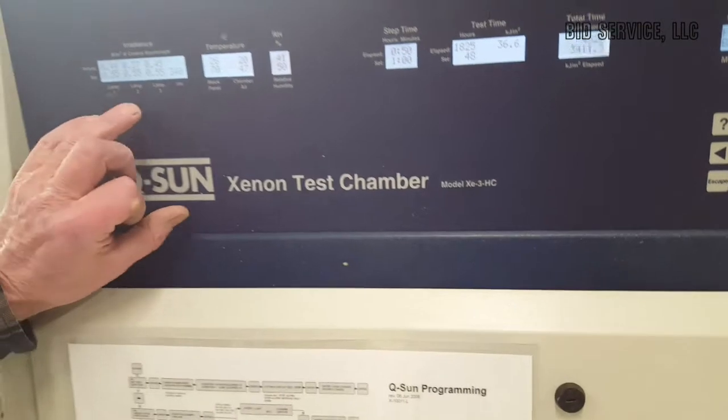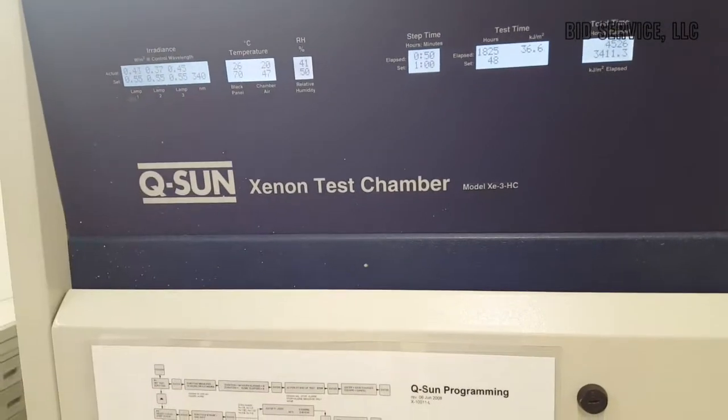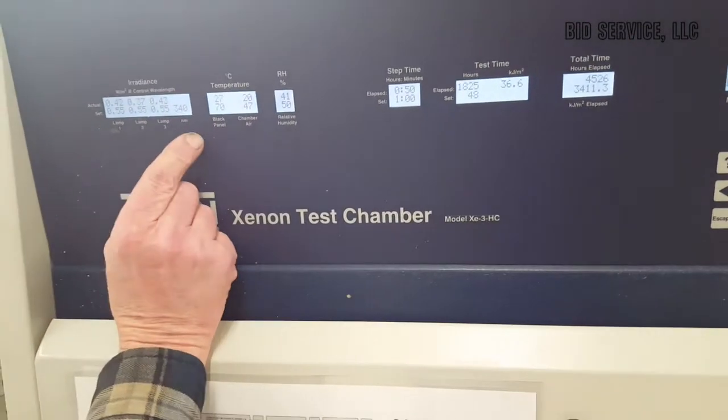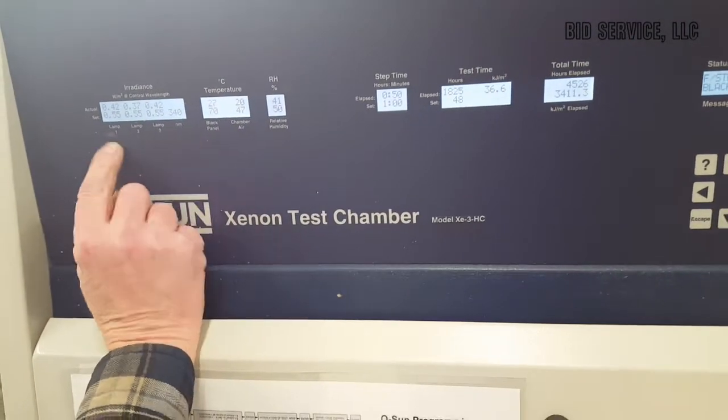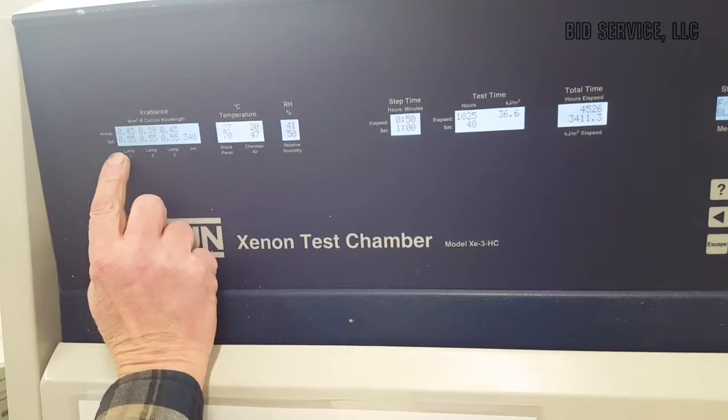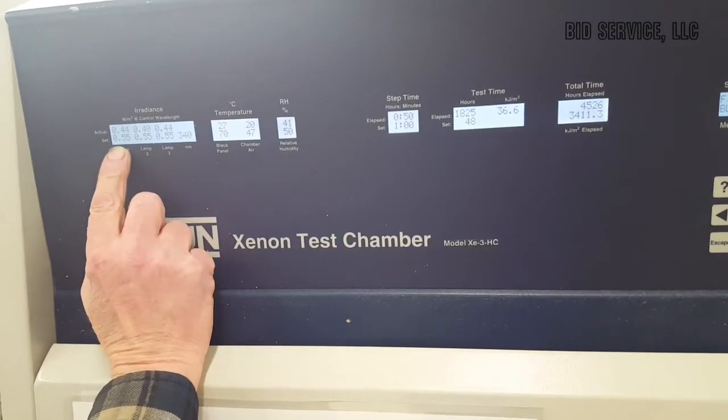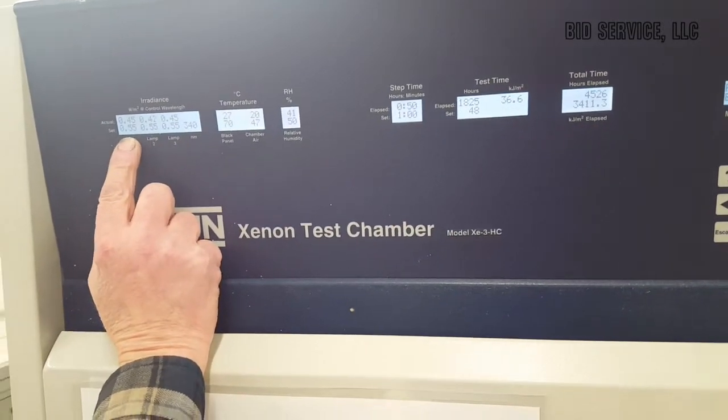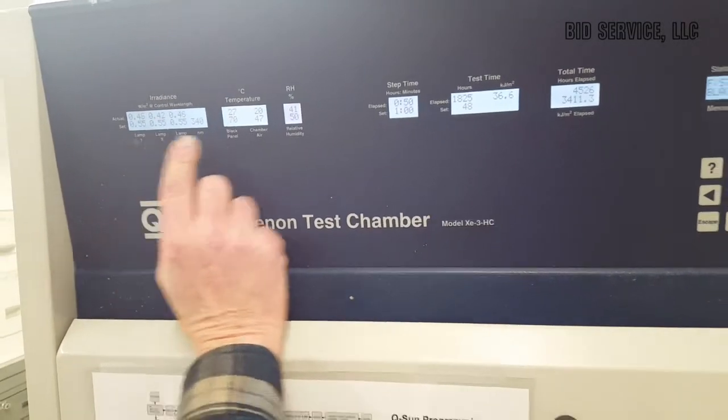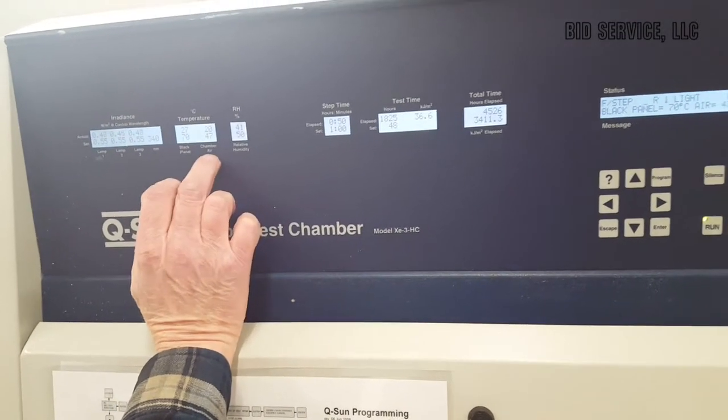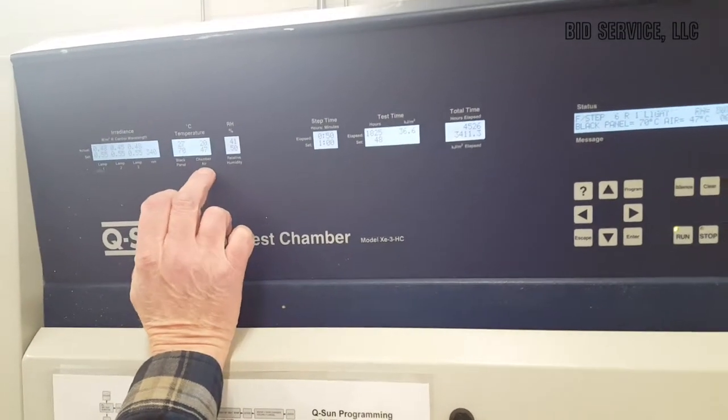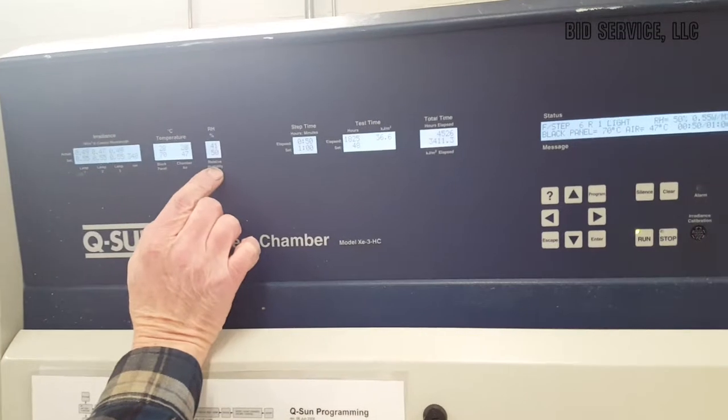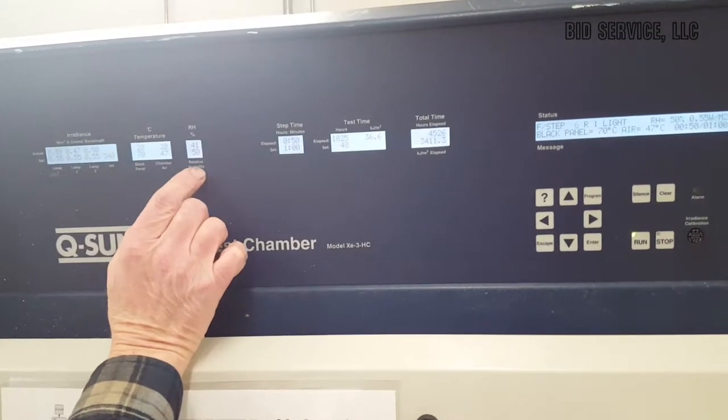Now, as you can see here, our Xenon lights have gone on. Our set points are 0.55 watts. This is our set point for our temperature, our chamber air, and our relative humidity.